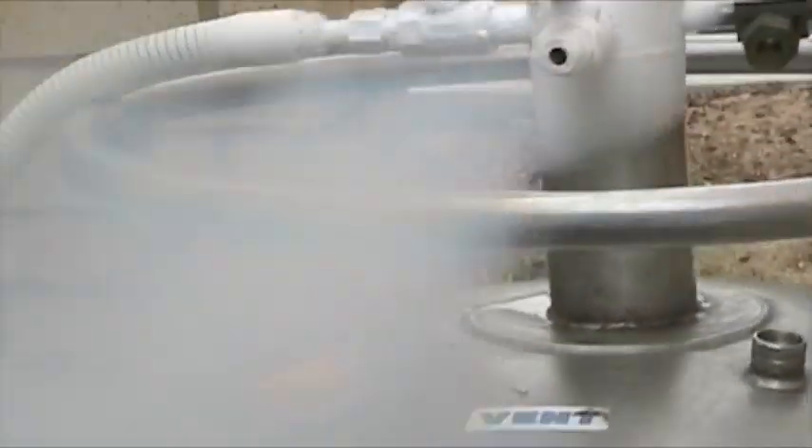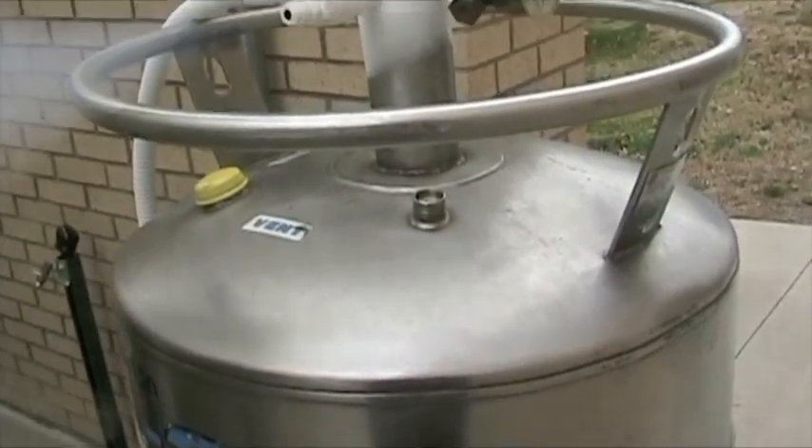The gas itself is just very cold gas. I'm sure that sounded wonderful, but anyway, there you go — more liquid nitrogen.